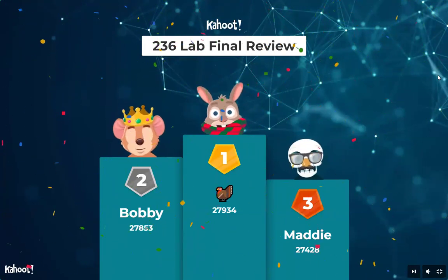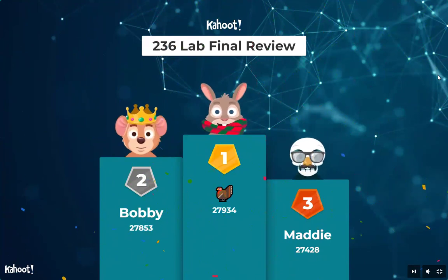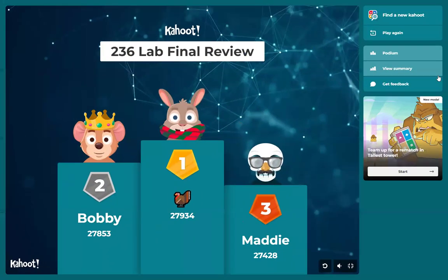You want me to explain it a little bit? So, starch hydrolysis, we have a normal color plate usually. Inoculate it, and we'll add iodine to it. Iodine turns starch that dark purple brown color. Your organism actually uses the starch. I can make this easier for you if you want.